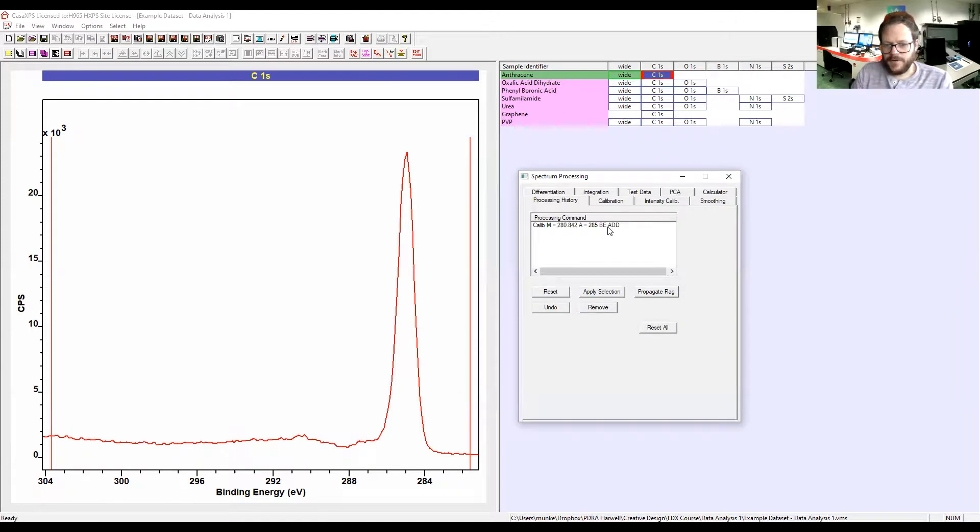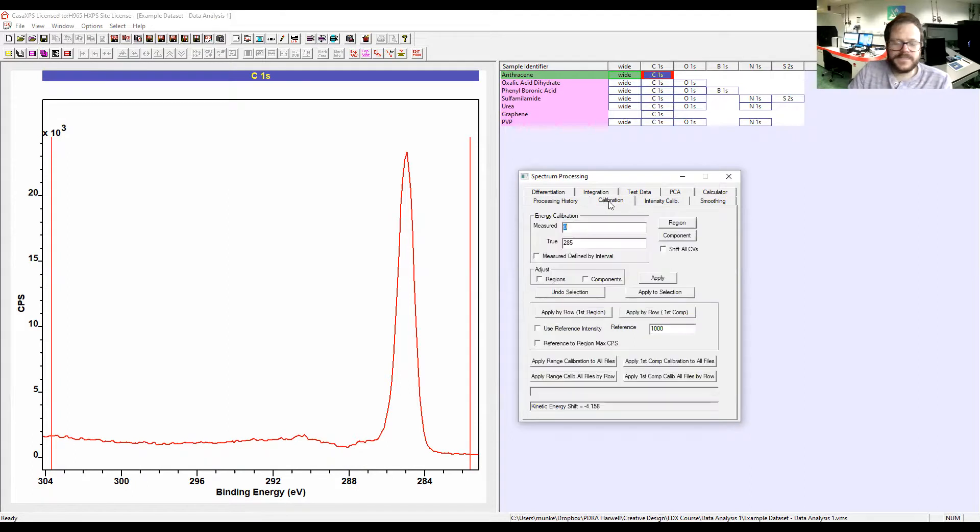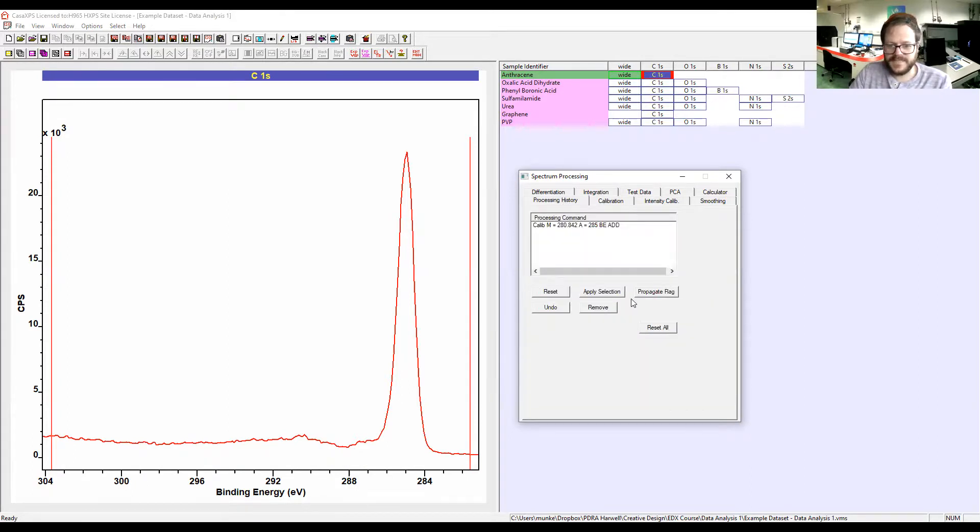Very few things are actually permanent in CasaXPS. Most of the things that you do can either be removed in their individual windows or you can come to Processing here and just reset and remove everything you've done. Don't worry too much if you're playing around with Casa. There's very few things that you can actually do to permanently disfigure your data.